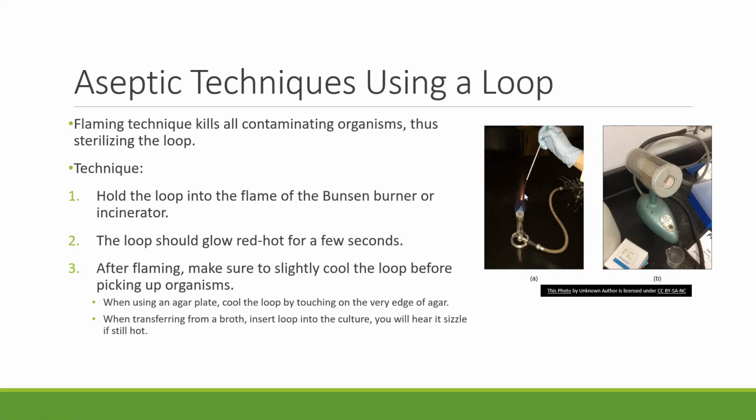Once you have it red hot for a few seconds, then you pull it out of the flame or you pull it out of the incinerator, and you're going to let it cool for a few seconds. And you have to let it cool, because if it's so hot to kill any contaminants, it's also going to be too hot and it'll kill your sample that you're trying to transfer or move or work with in lab. So you're going to allow it to cool for just a few seconds.